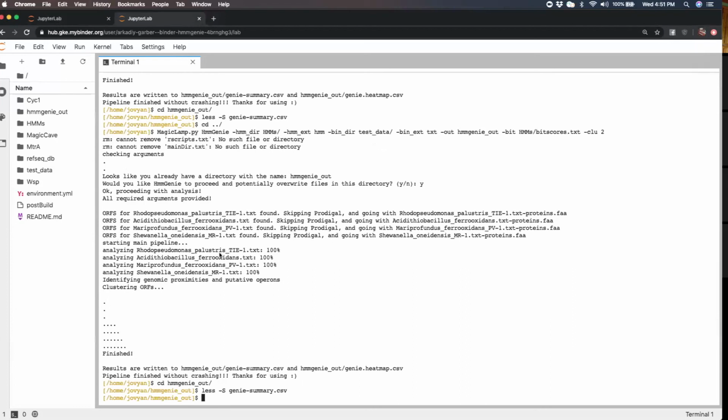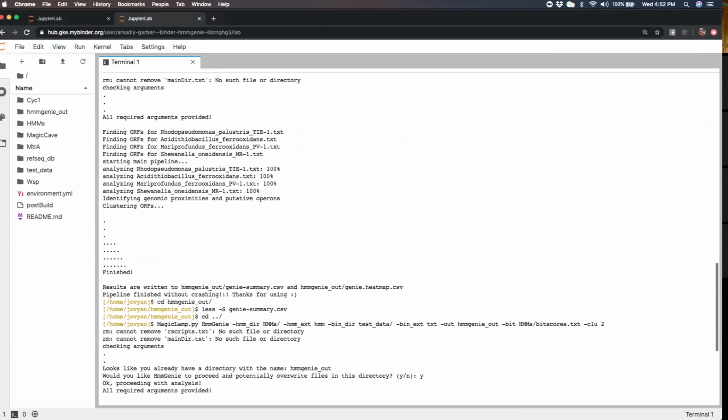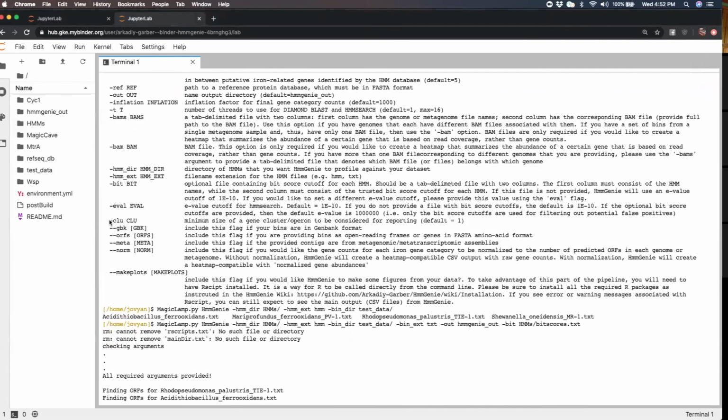Okay, that's actually it for this tutorial, unless there's any questions, or unless I'm forgetting something. There's the e-value, there's the BAMs, everything's similar. Okay, yeah, so I wouldn't advise this if you have a collection of HMMs where not all things are in one operon.